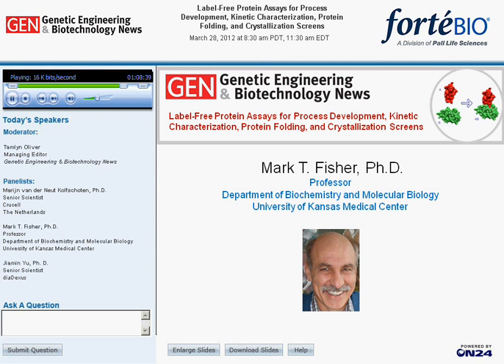using electron microscopy. So we had the advantage of actually knowing what we were looking for, and indeed, we know what an aggregate looks like, and we know what a pre-pore looks like, and we know what a pore looks like. So we could definitely pick out the pore conformation. Thank you very much, Mark.